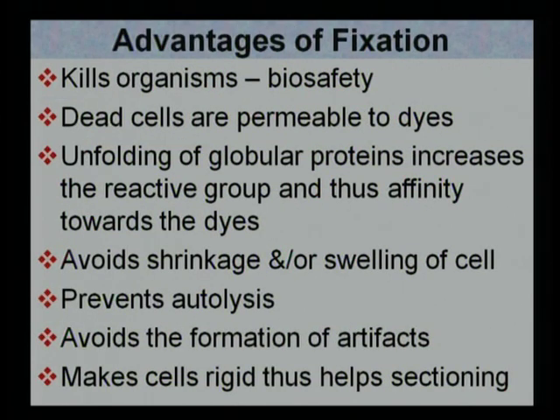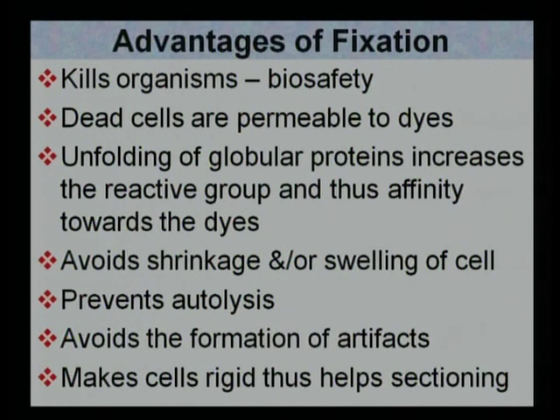Now, the advantages of fixation are also many. It kills the organisms and naturally it imparts biosafety. Since the cells are killed by the fixatives, either heat or chemicals, because the cells are dead, they lose their selective permeability. Otherwise, you know that the cell membrane is selectively permeable and will not permit dyes to enter the cells. So when these cells are dead, their permeability increases.